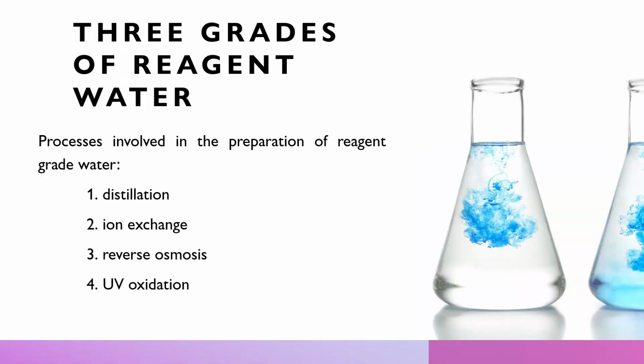As we all know, class, water is the most frequently used reagent in the laboratory. Because tap water is unsuitable for laboratory applications, most procedures, including reagent and standard preparation, make use of water that has been substantially purified. Water solely purified by distillation, class, is what we call distilled water.